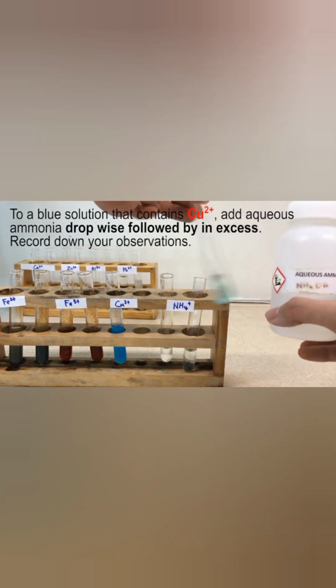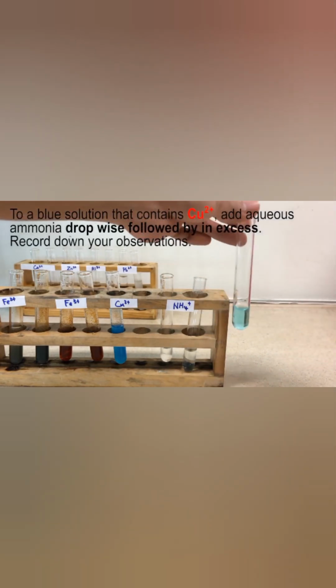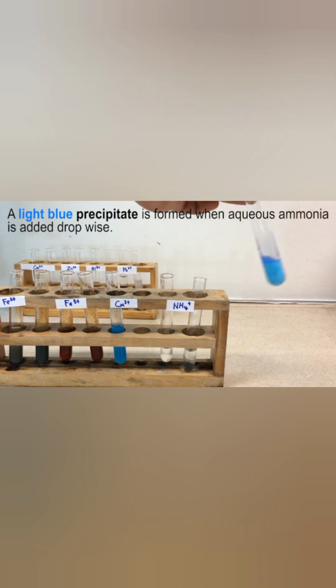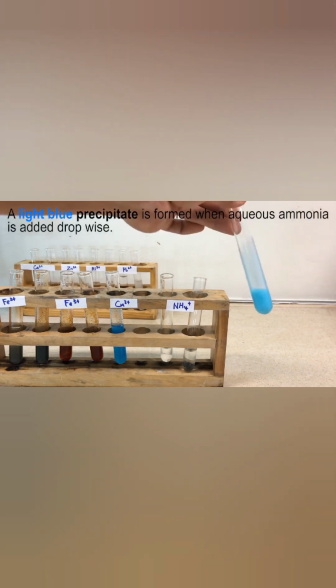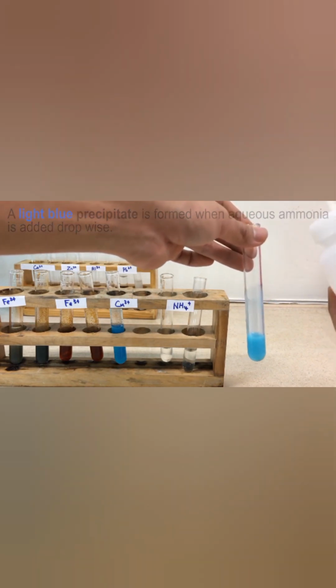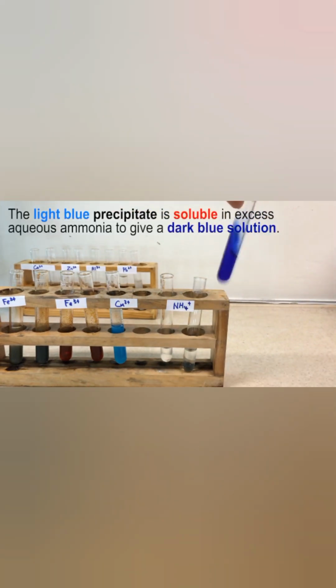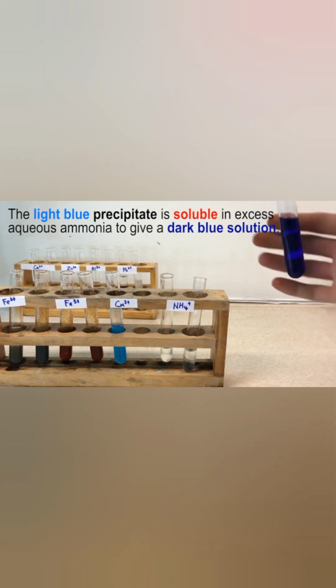Okay, to a blue solution that contains copper, add aqueous ammonia in drops followed by in excess. Adding aqueous ammonia in drops, a light blue precipitate is formed. Now when you add aqueous ammonia in excess, the light blue precipitate is soluble.